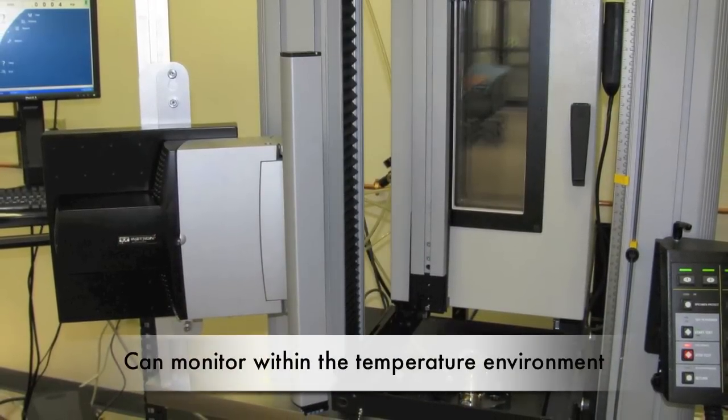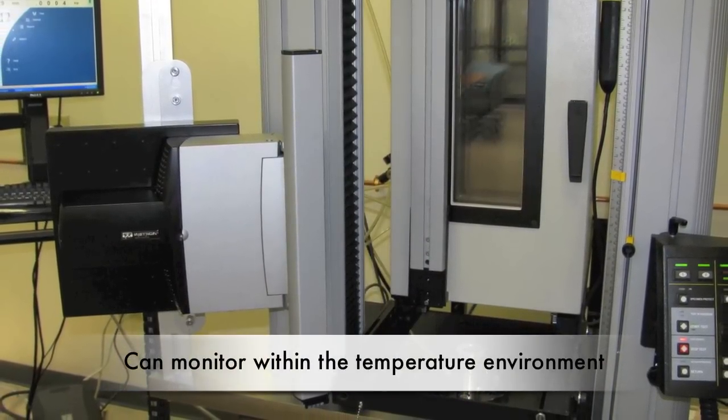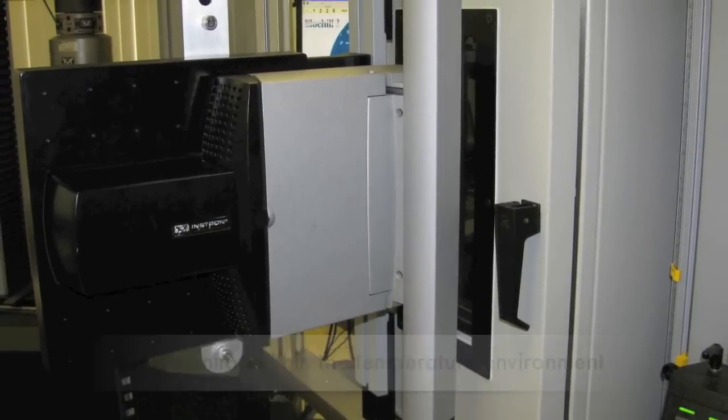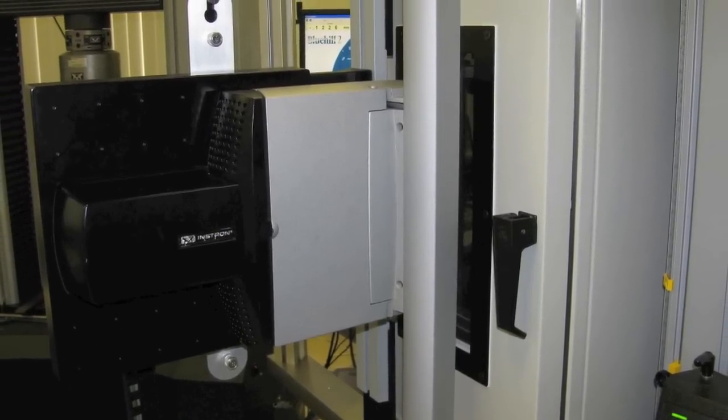The video extensometer can also be attached to the temperature environment. This allows the video extensometer to monitor tests when in a temperature regulated environment.